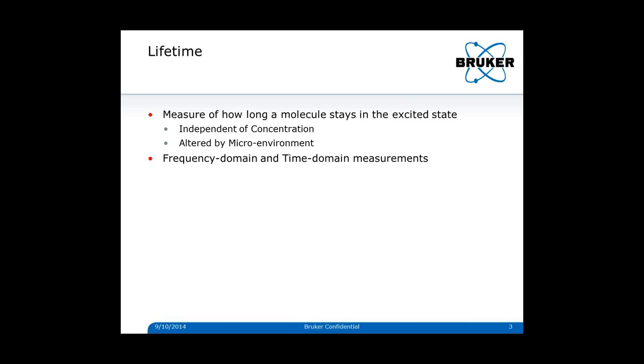The other property is that the lifetime can be altered by the microenvironment that the molecule resides in. And actually Dr. Scala will talk more about this and give you experimental data and results about that. But essentially the lifetime can depend on the pH, temperature, presence of oxygen, or proximity to other molecules with certain spectral characteristics.